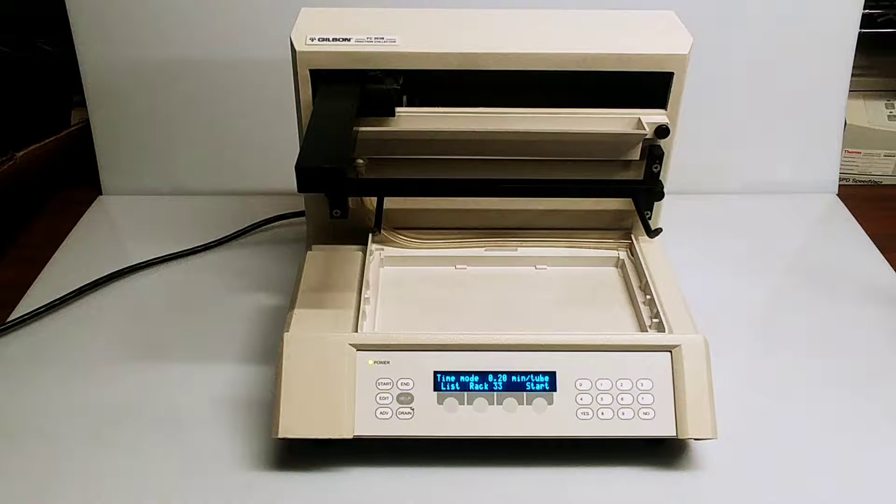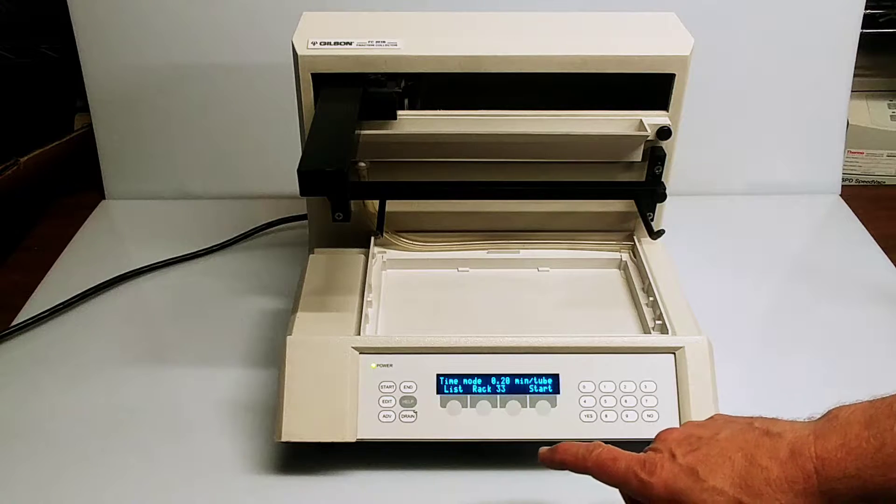Hi everyone, this is a video to show the operation of a Gilson FC-203B fraction collector. It's in great shape. I just wanted to run through how it operates.